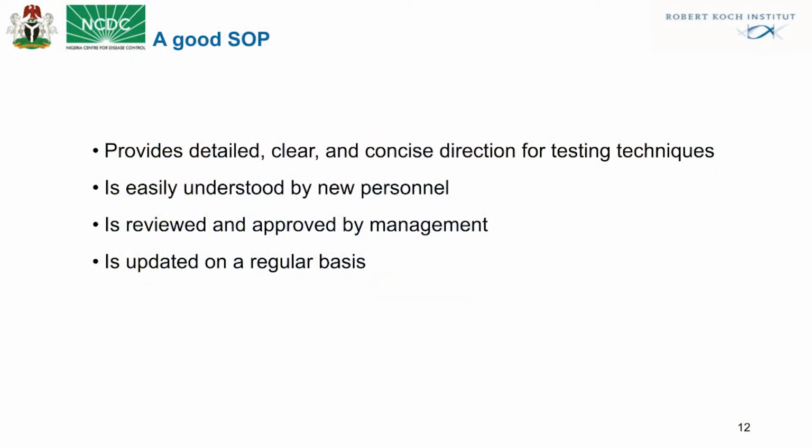A good SOP provides detailed, clear, and concise direction for testing techniques. It is easily understood by new personnel. It should be reviewed and approved by management. It's updated on a regular basis. This shows an example of how an SOP should be.